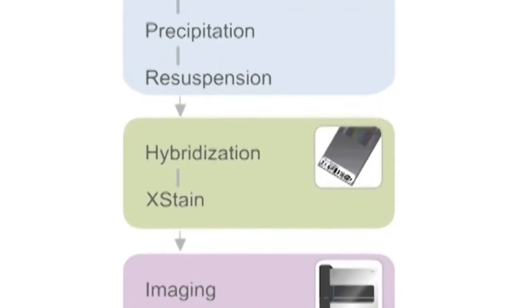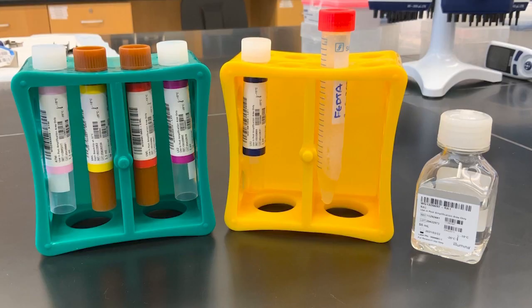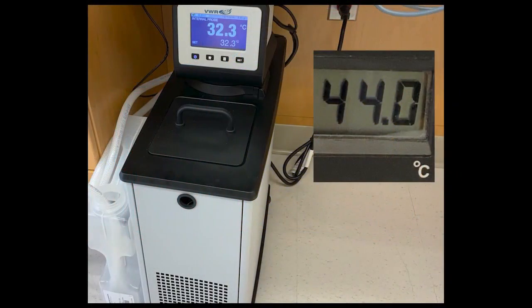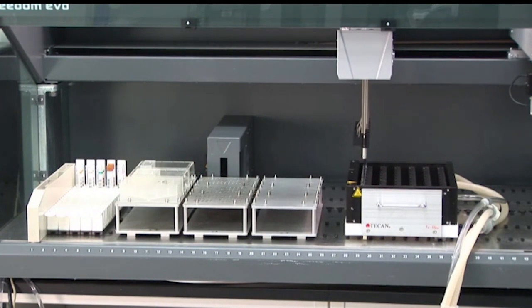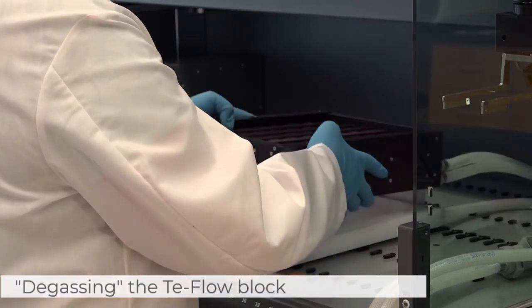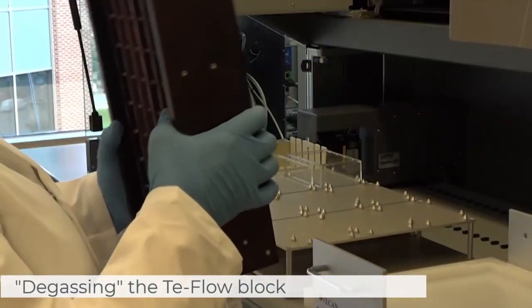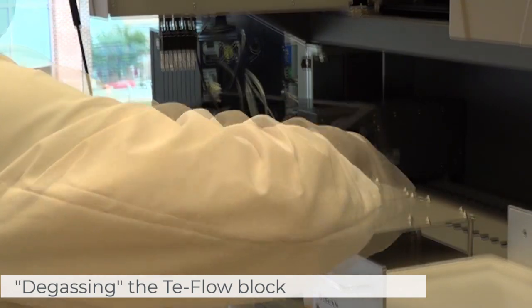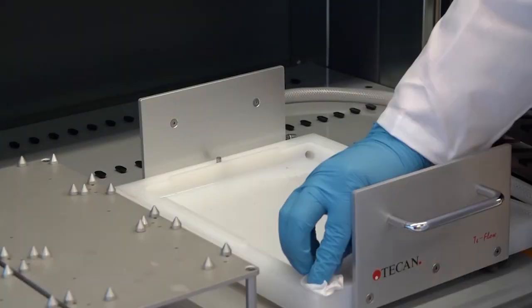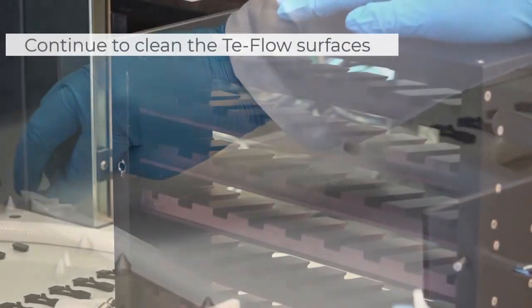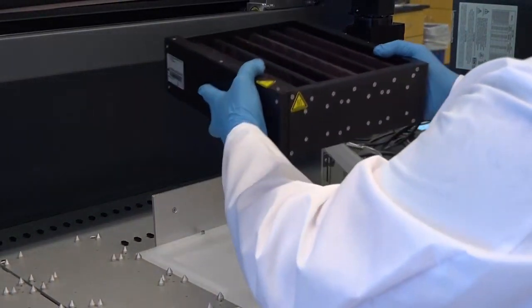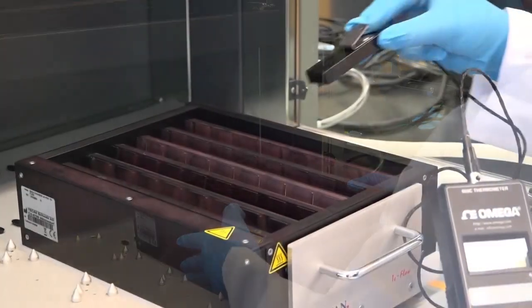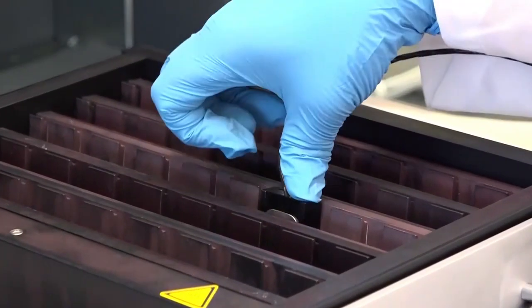The next step in the Infinium assay is X-Stain. Thaw all X-Stain reagents. Set the water circulator attached to the Te-Flow block to 44 degrees Celsius. If performing X-Stain on the Tecan robot, the water circulator will automatically turn on to 44 degrees. Before using the Te-Flow block, rotate the entire unit to allow any air bubbles in the block to escape. Air bubbles can lead to uneven heating of the metal and may lead to sub-optimal data quality. Check the temperature with a probe in several locations to ensure uniformity.